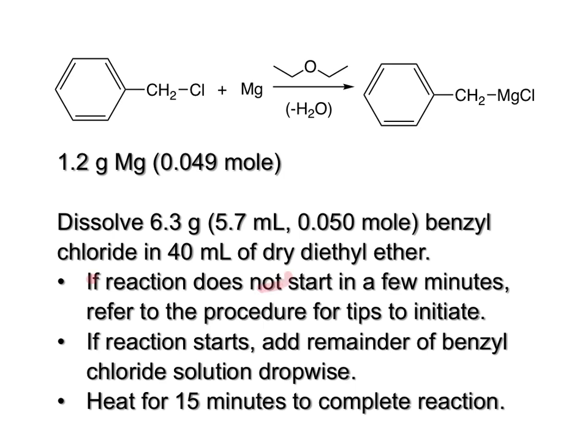If the reaction does not start in a few minutes, go back to your lab procedure for tips to help you get the reaction to initiate. This might include things like adding a little heat, not on a hot plate, just with warm water in a beaker or a pan, or adding a crystal of iodine. All of those things can help the reaction start if it's being slow.